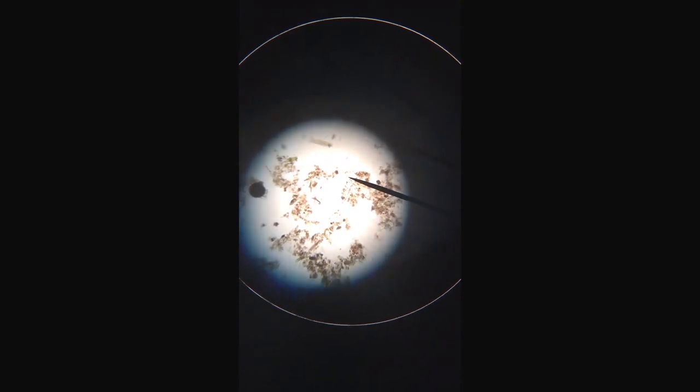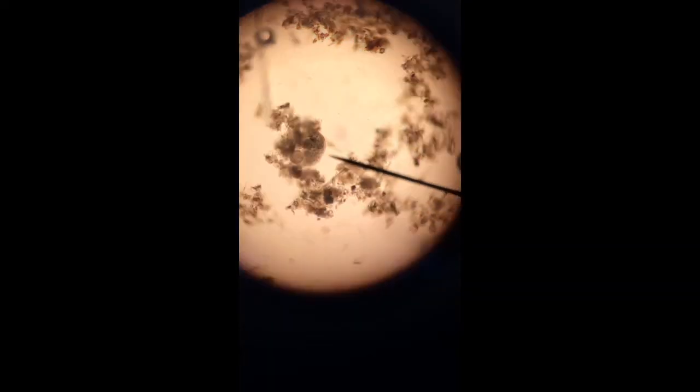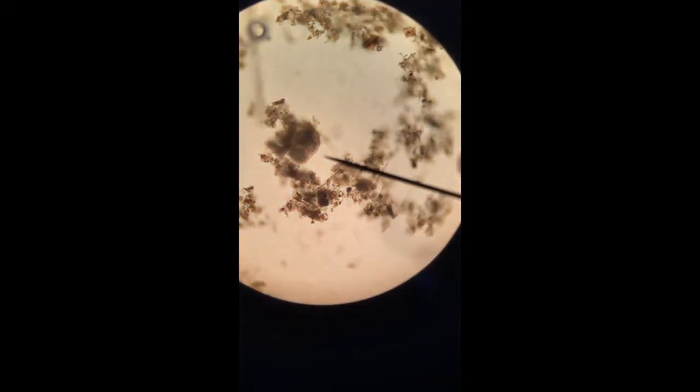Look at that cute little worm, look at the camera! I found the more original one. Let's see if you're shooting it. Whoa, it just totally took off. It's not collapsing. I really don't know what that is. It's really cool. I wish we had a cell phone adapter.